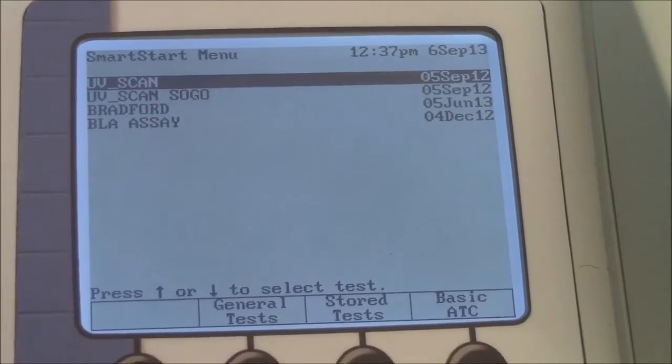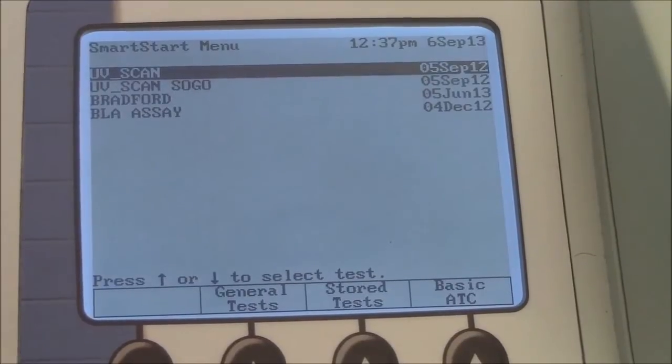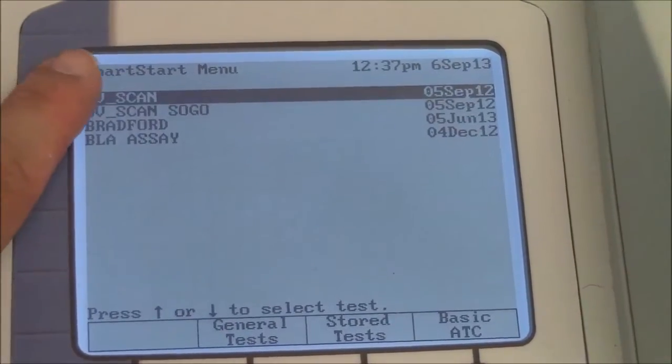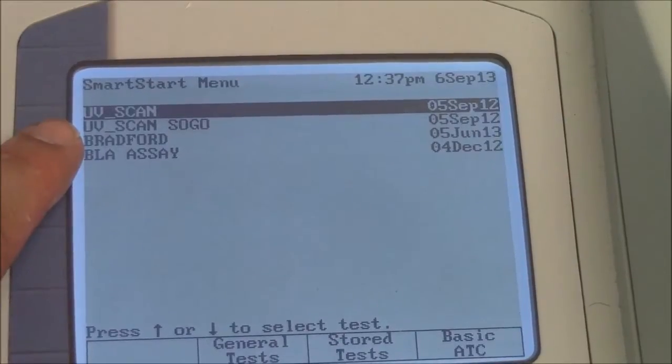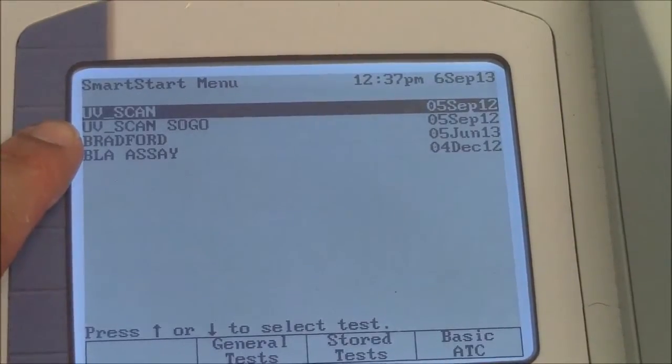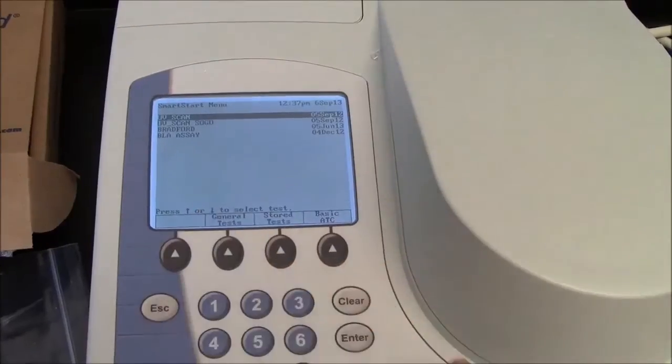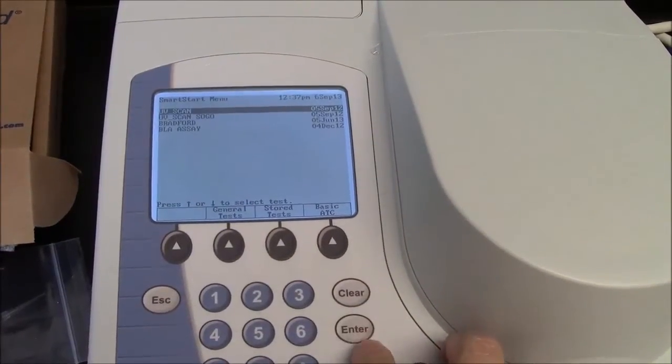After going through some initialization procedures, this is called the Smart Start Menu. And in this case, we want to do a UV scan. So when the appropriate choice is highlighted, I will press this Enter button.